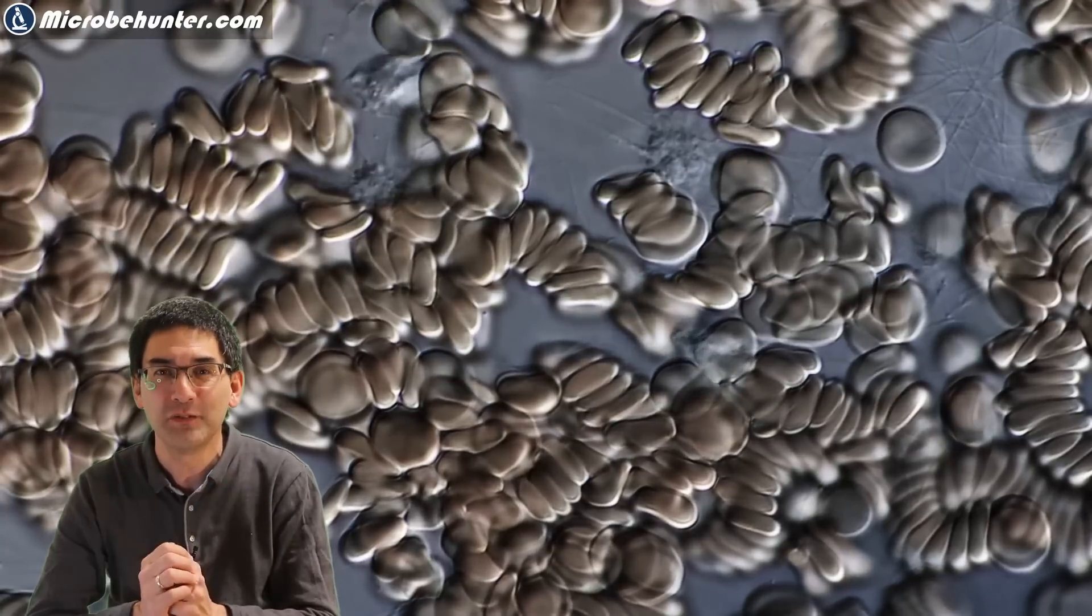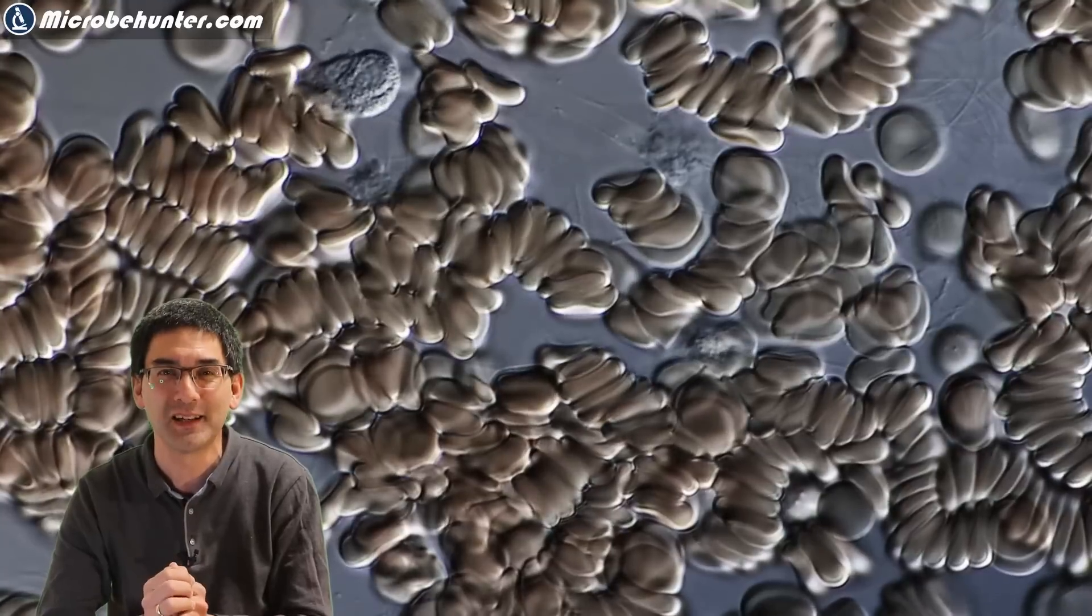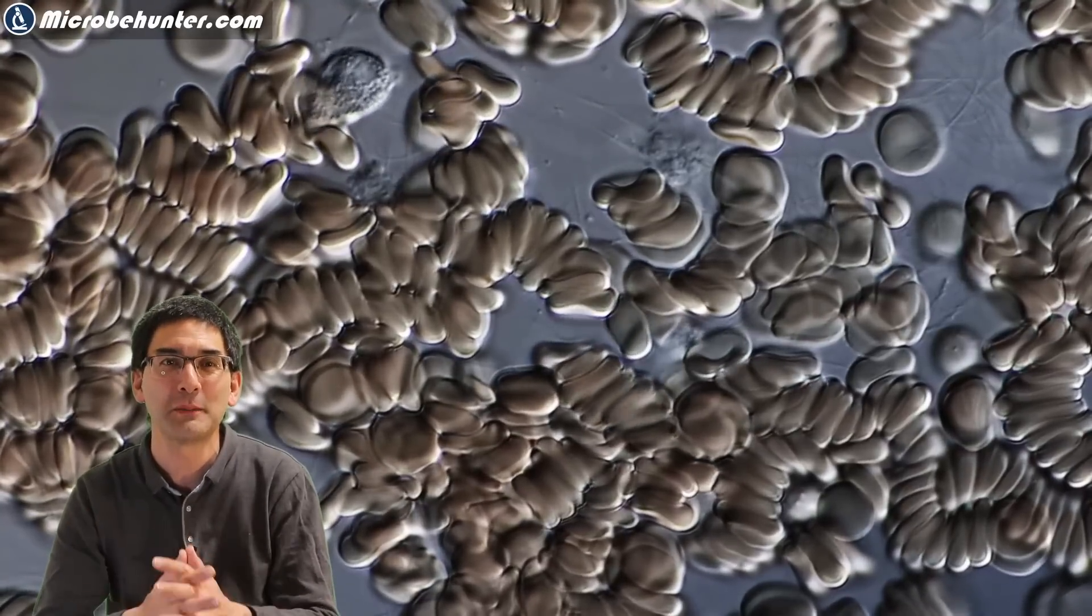But I promise you, towards the end of this video, I'm going to show you some really nice videos that are made of those white blood cells.